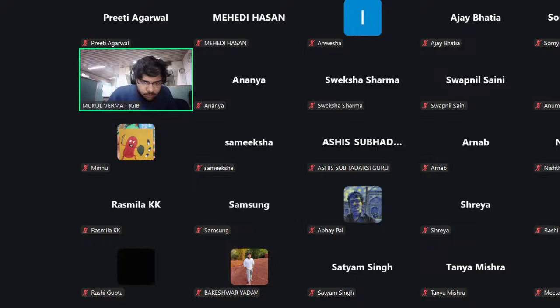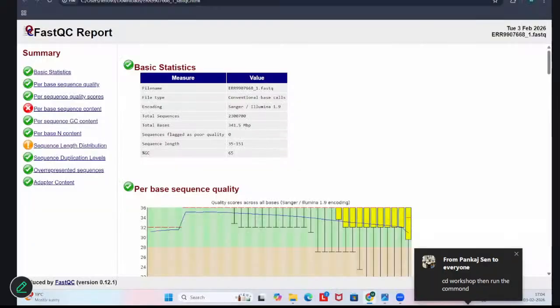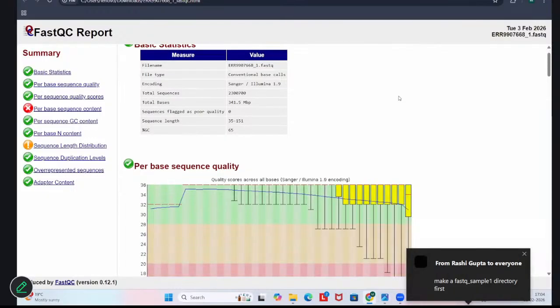So everybody can see this, your FastQC report is on your screen.